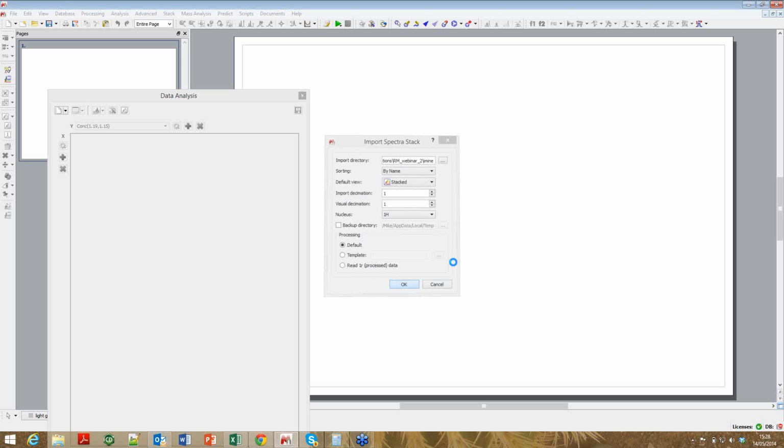Okay, there's actually quite a bit of overlap with this data set from what I showed you in the first data set. So I'm going to whip through it really quickly, and this will be a reiteration. Now, there are softwares out there that try to automatically track peaks that move, and it's a worthy objective.